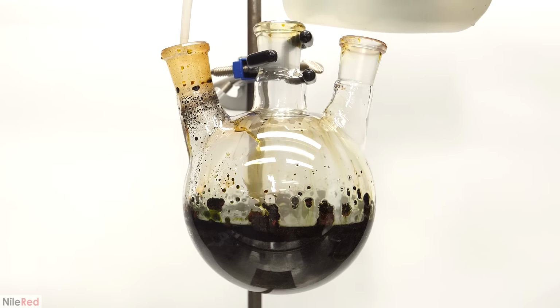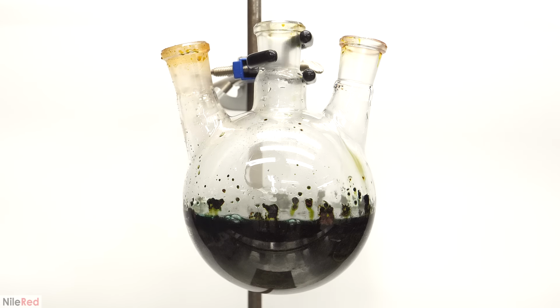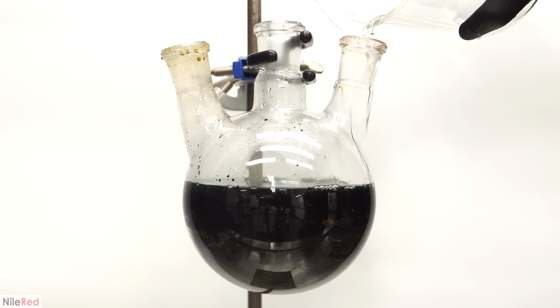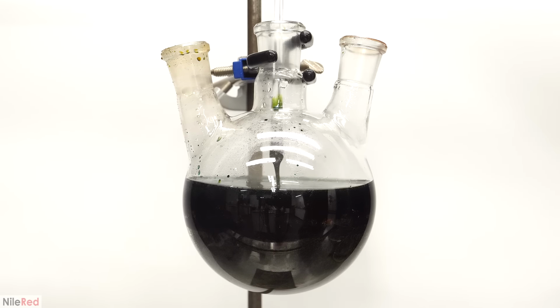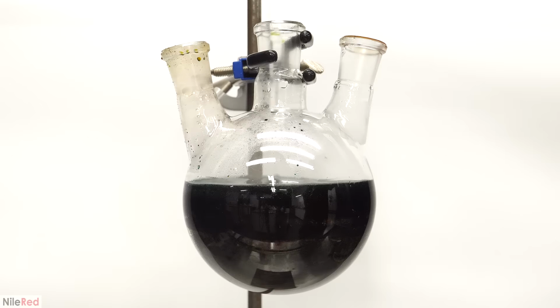The added water would also dissolve some of the side product salts, which would help get them out of the flask. As we saw before, it all quickly turned green, but this time, it also warmed up quite a bit. This was because there was still a lot of concentrated sulfuric acid that was left over from the reaction, and it generated a lot of heat when it dissolved into the water. To a certain extent, the reaction with the chromyl chloride also generated some heat, but I don't think that it was nearly as much as the sulfuric acid.